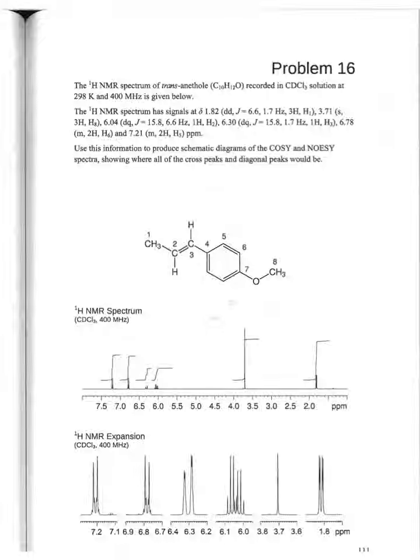I don't recall in the exam if the spectra you're going to look at have expansions or not. But normally they tell you what the chemical shifts are, so pay attention to those things when you're counting. So there's proton, there's expansions. So I'm going to use the numbers they have here. So 1 here, 2, 3, down the chain there.